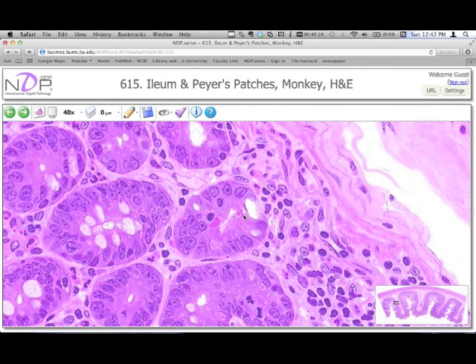They have eosinophilic granules, the contents of which discharge into the lumen of the ileum. And so our first goal really is to make sure that in our identification we're not looking at the epithelial sheet itself, because it has cells with eosinophilic granules. Okay, so now we have that under our belt.